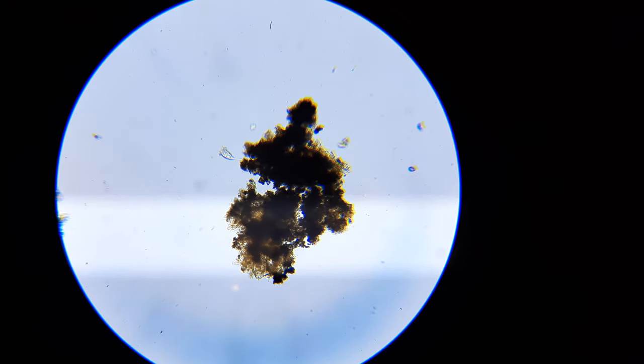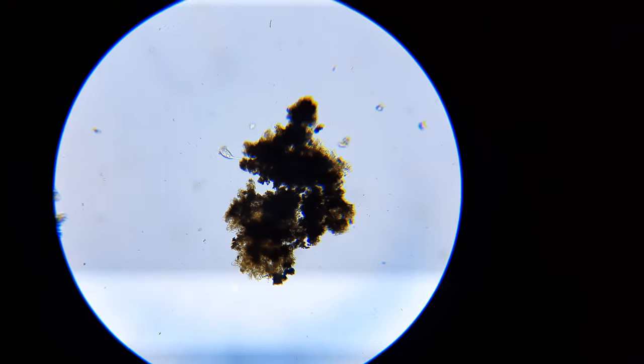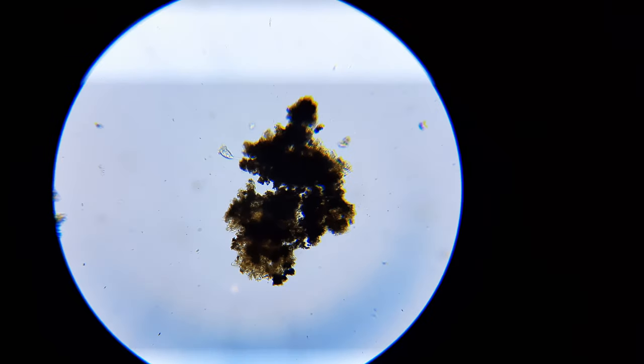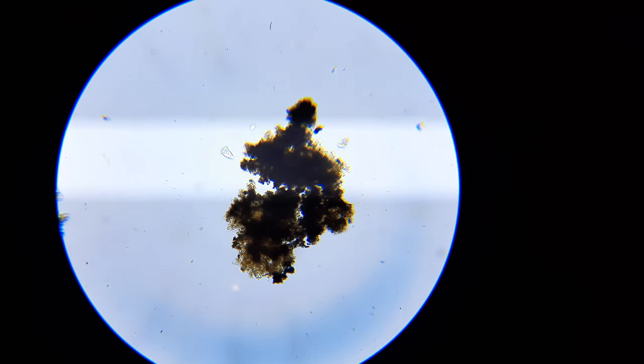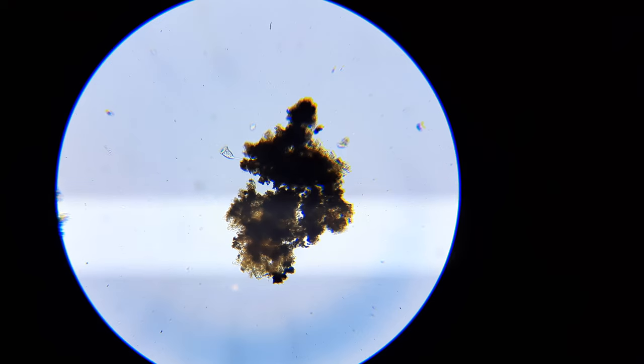Whereas with a regular constant light source, the cilia on the vorticella is basically impossible to see.